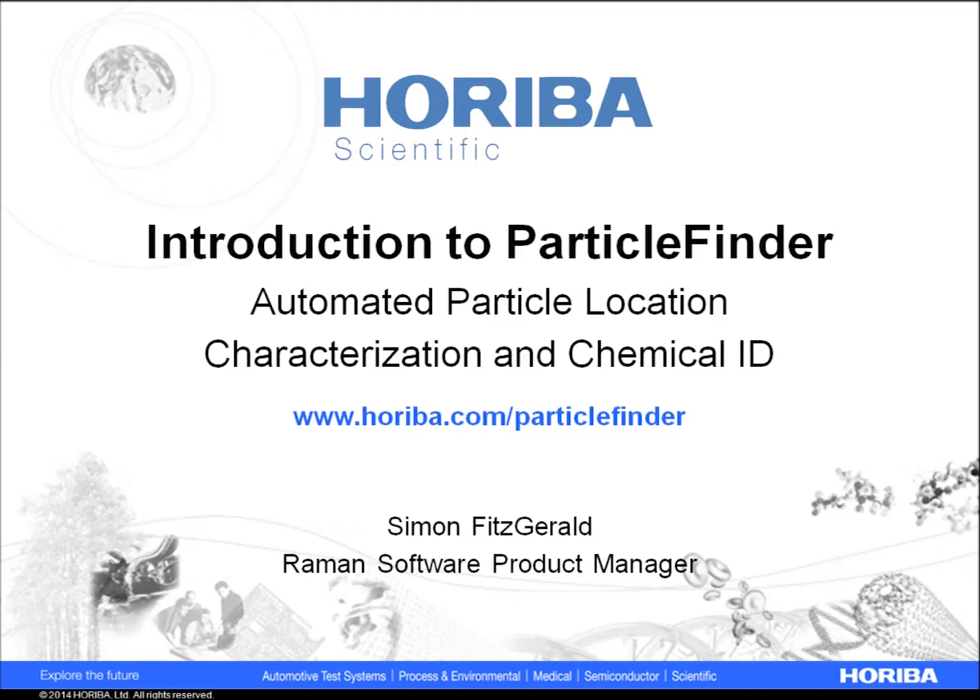Welcome to this introduction to Particle Finder, a particle location, characterization, and chemical identification tool based on HORIBA Scientific's Raman Microscopes.